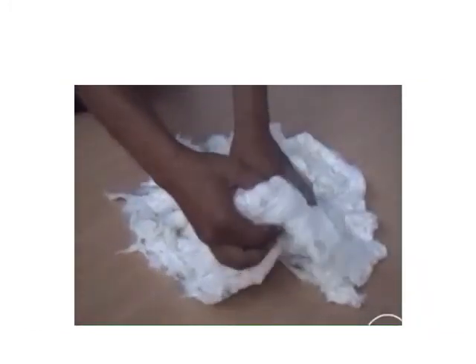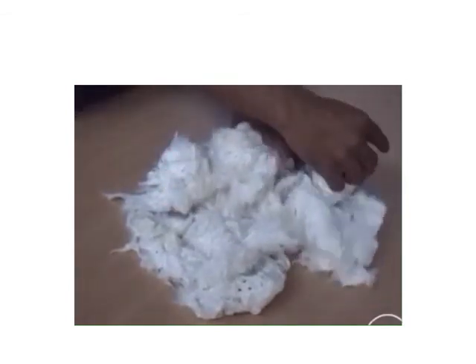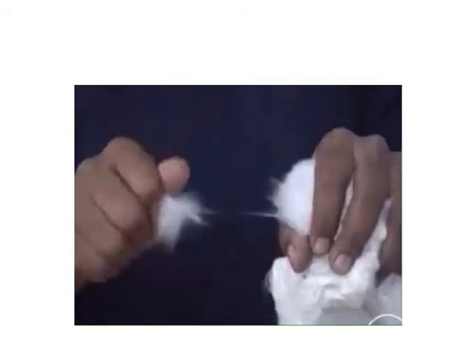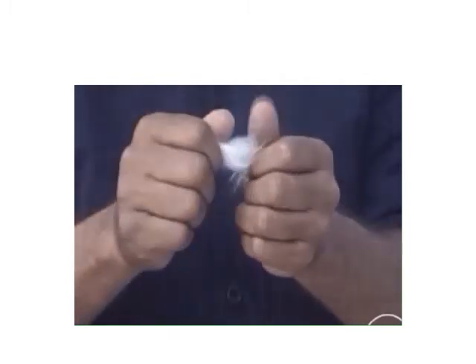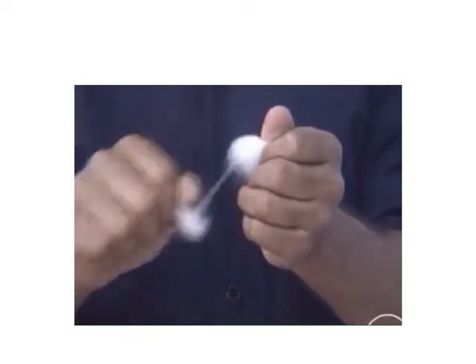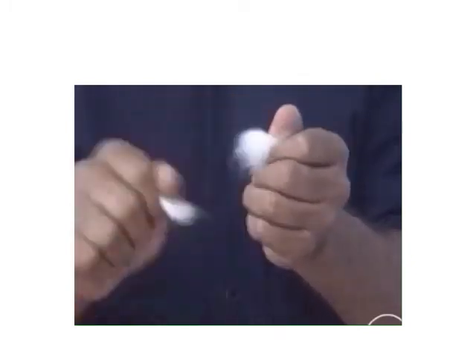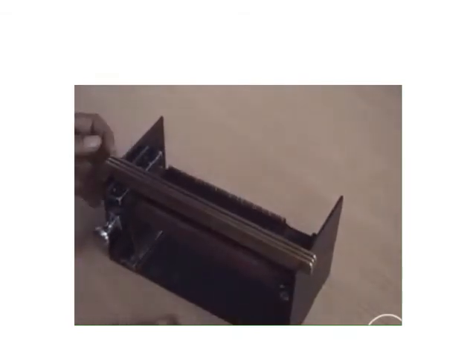Now let us see how to do the experiment. There is a bunch of cotton fiber. The cotton fiber is taken from all the places, and you take a representative sample by the zoning technique. The fibers are kept between the two hands as shown in the video, and you have to draft and double the fibers to prepare a representative sample. Then you turn the instrument such that the back side of the instrument faces the operator.